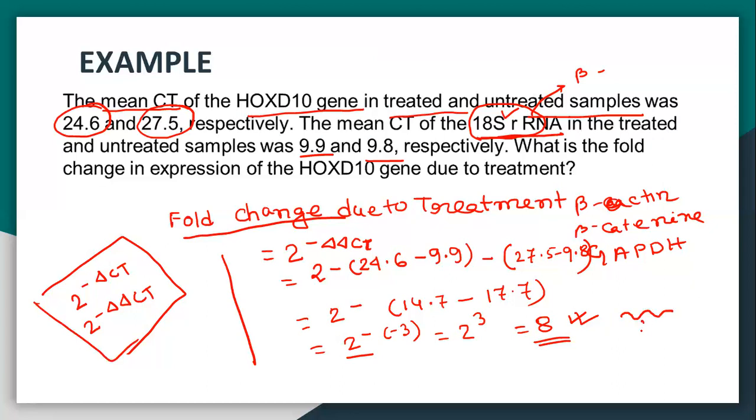Single-stranded RNA is converted into cDNA by the reverse transcription enzyme, and this cDNA is used for amplification. Then, using different TaqMan probes or SYBR Green probes, we can analyze the expression of a specific gene in the samples.